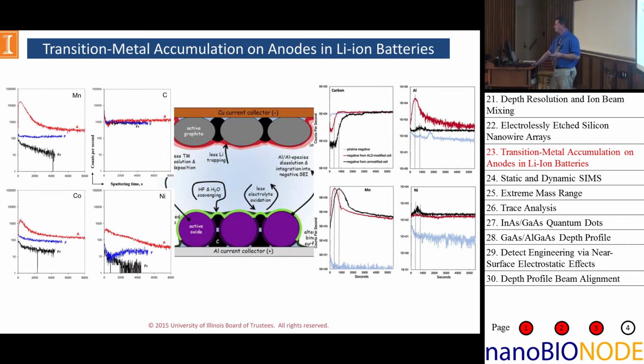We did some additional experiments where we put an alumina coating on top of this, and from that we did the same type of experiment. Now you do see that there is some aluminum that moves, and there's still some manganese that moves, but the effect from the cycling and the measurements is that even though there is some rise in impedance, it's significantly inhibited. We do still see some motion of these elements, and therefore there is still some loss due to that, but this helped to increase the lifetime of these batteries significantly.